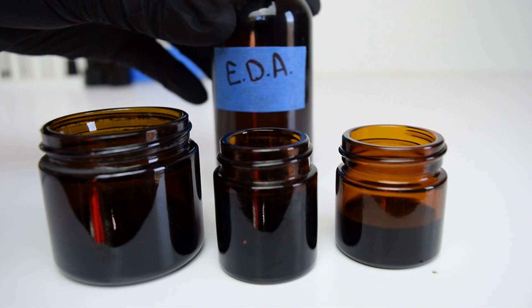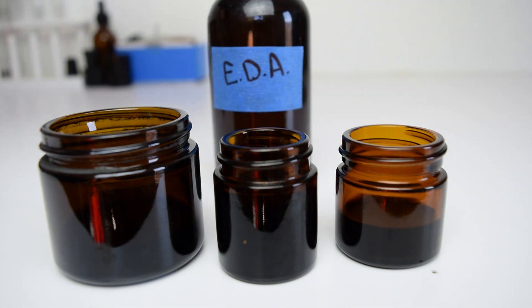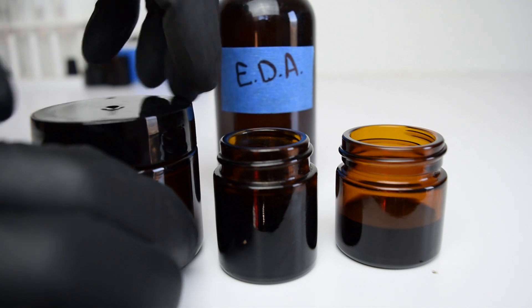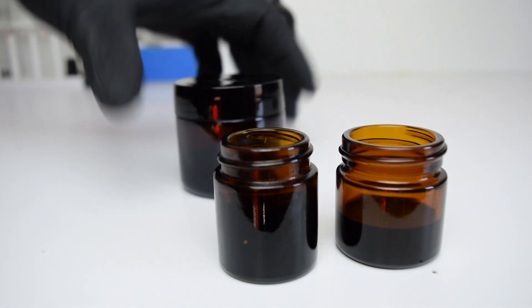Now you'll need to add the ethylene diamine to the solution. 20 microliters is basically the size of a droplet. Once you add the ethylene diamine, you'll need to mix it in as it starts to work right away. I simply seal the container and shake it up as I walk over to the oven, much more than what is shown here.